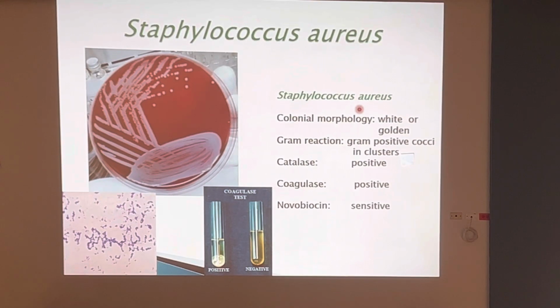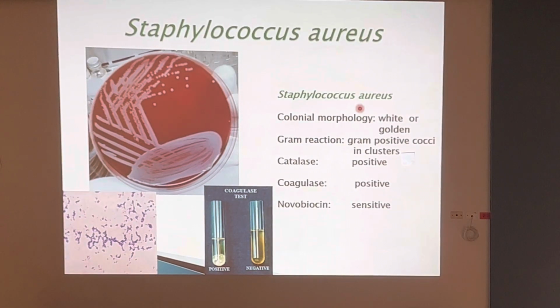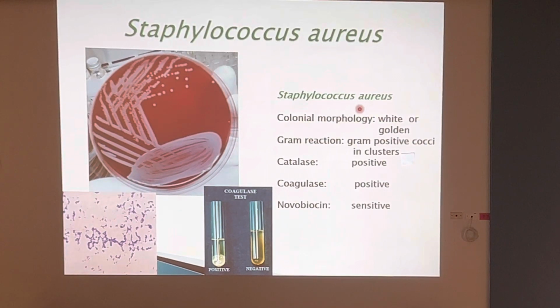In addition to being coagulase positive, Staphylococcus aureus is also susceptible to novobiocin.